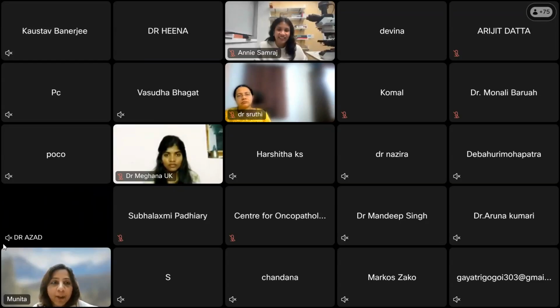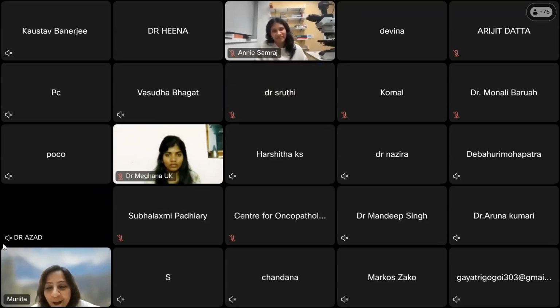And it is for the pathologist to determine where the primary is. Is it an ampullary primary? Is it a CBD cancer going into the ampulla and pancreas? Or is it a primary pancreatic head cancer secondarily involving the ampulla? Because that is how the staging will pan out.